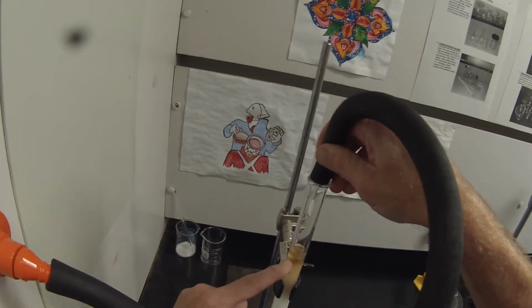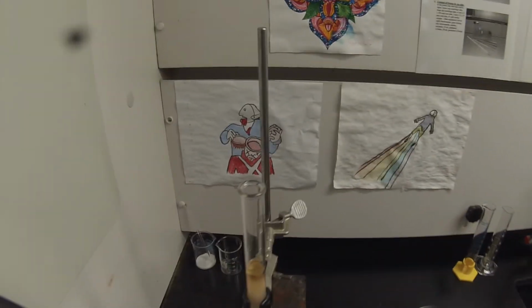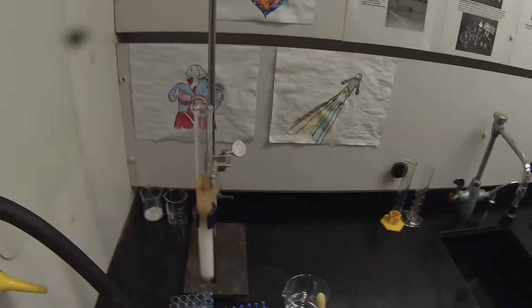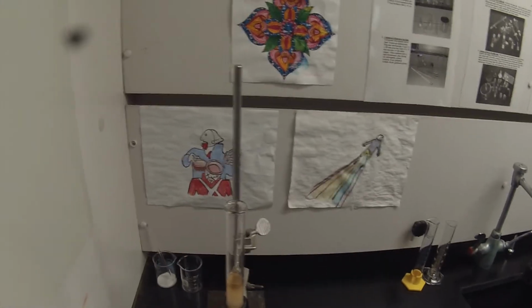Since I'm about to switch the eluent, I'm going to let that meniscus go pretty much all the way down and add the first little bit. So this is what's called a step gradient. I'm going from pure PET ether immediately to a 1 to 2 PET ether to diethyl ether mixture. If we had a fancy pump assembly, we could gradually change the composition by having 2 different pumps pumping the solvent in.